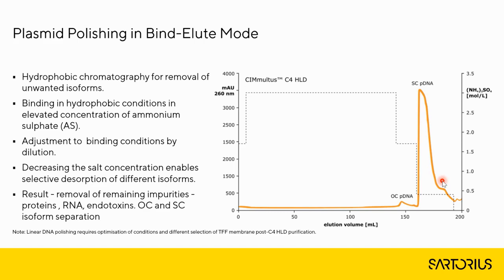And here we also understand the behavior of supercoiled very well, in the sense that we've demonstrated time and again that no matter what the size of the plasmid is, we can pretty much always use the same concentrations of loading salt, which in case of HIC for the purification of plasmid is ammonium sulfate. And we now understand the concentration of ammonium sulfate so well that we can pretty much prescribe a generic concentration of ammonium sulfate for loading and then for elution of supercoiled plasmid.